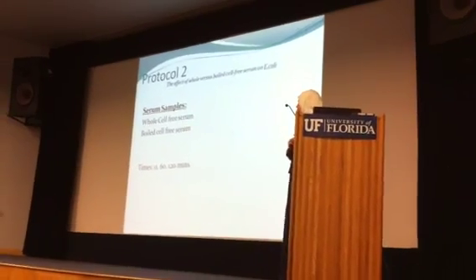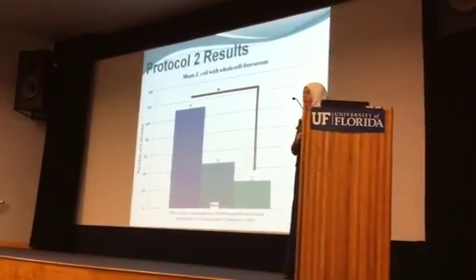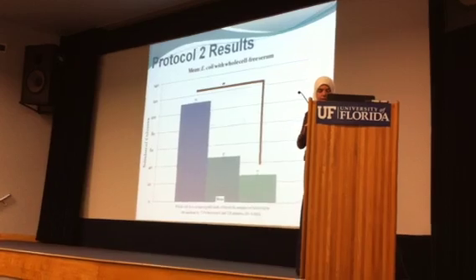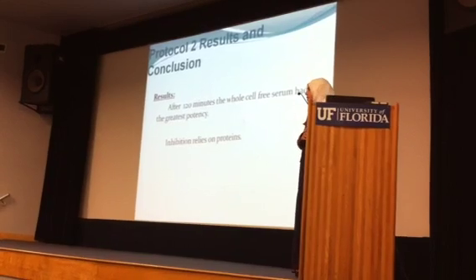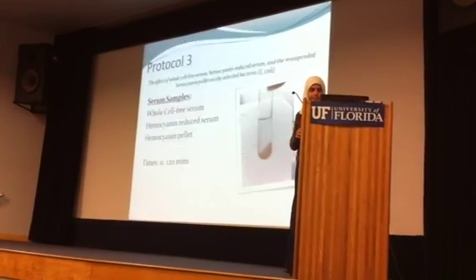For my second protocol, I used whole and boiled serum against E. coli, and as you can see with the whole cell-free serum between 0 and 120 minutes, there was a significant reduction in the number of colonies. However, with the boiled serum, there was not that much significant reduction. Therefore, I found that the proteins in the serum were responsible for the inhibition of bacteria.